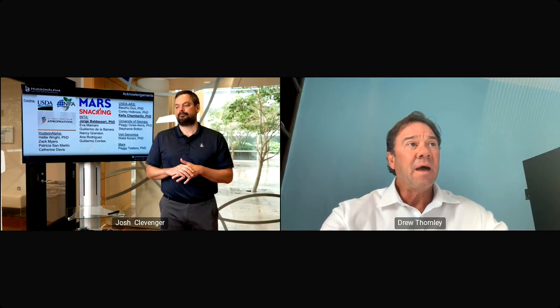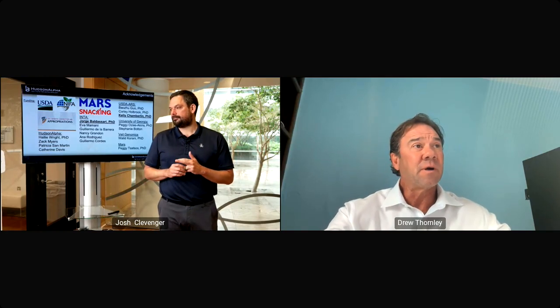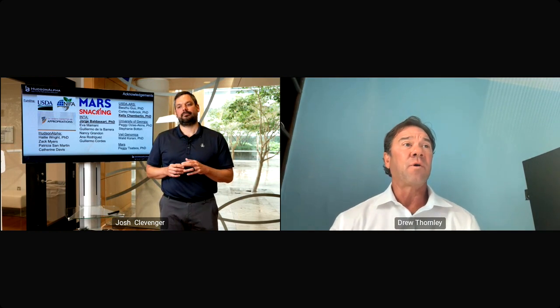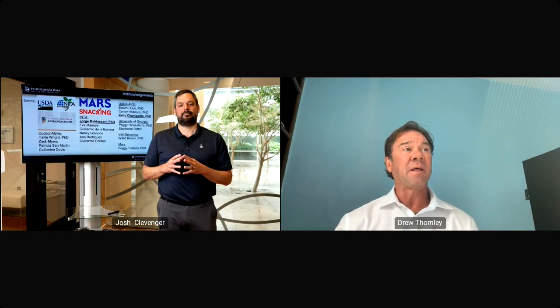Great. And this could be a long answer on this question. We may want to follow up with an email, but I'll start it here. Fifi says, how was the auto normalization done? Kindly explain how that works with the AgriPrep.